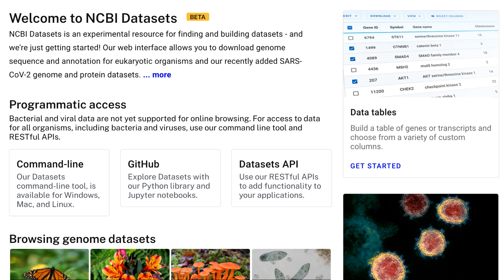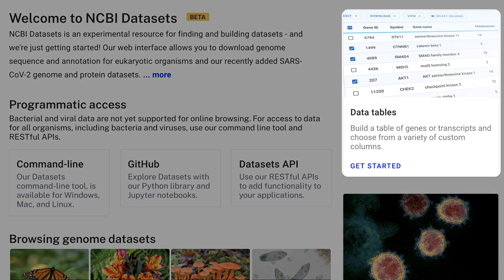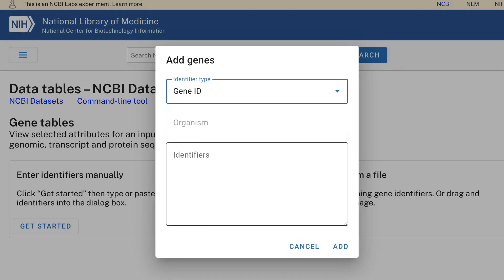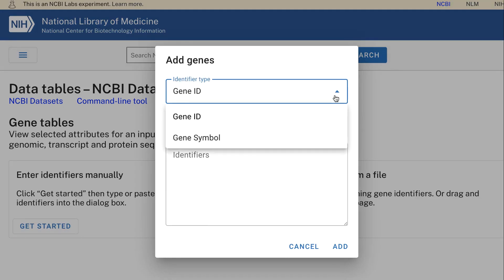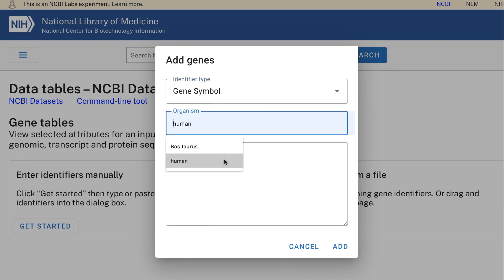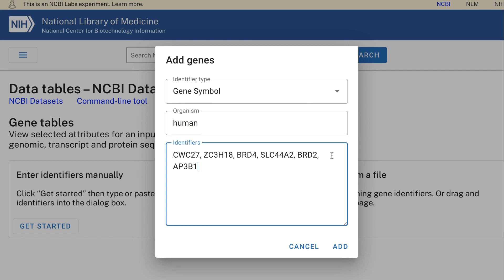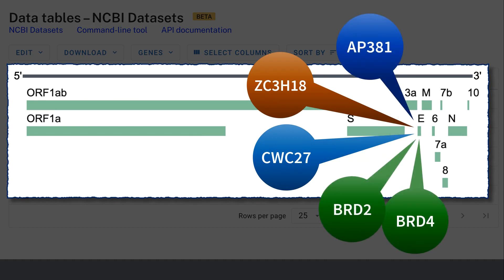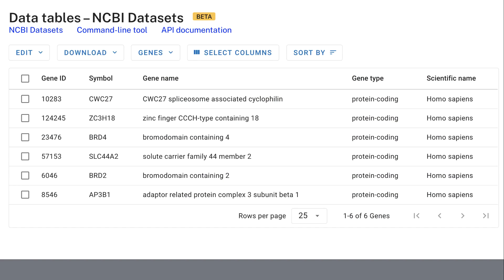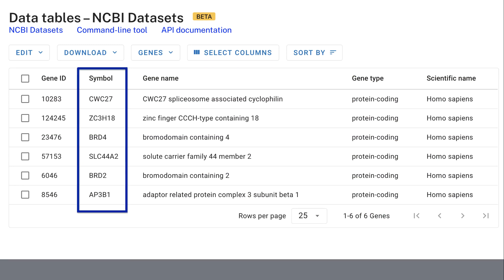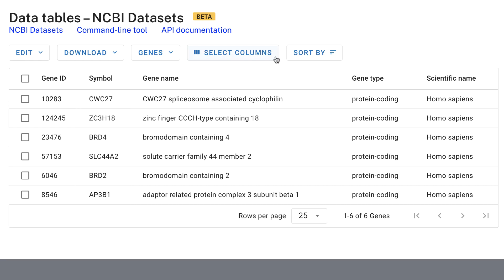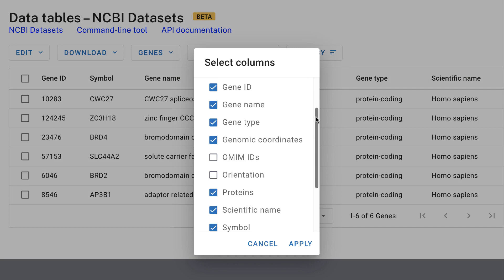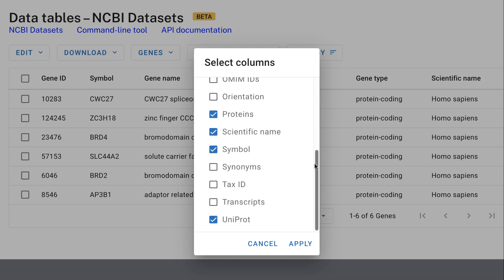Starting from the Datasets homepage, gene data can be accessed through the Data Tables link. To retrieve gene datasets, you can upload a text file with a list of NCBI gene IDs or gene symbols, or manually enter a list of gene IDs or symbols plus the organism name. Say you're interested in learning more about the human host proteins that interact with the viral envelope protein. You can create a gene table based on the human gene symbols taken from the paper. Customize your columns to get the information you want about each gene, including genomic coordinates and resources outside of NCBI, like UniProt accession.